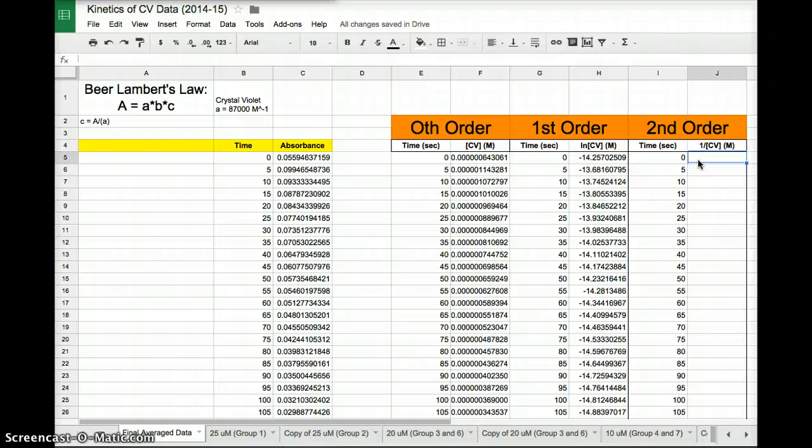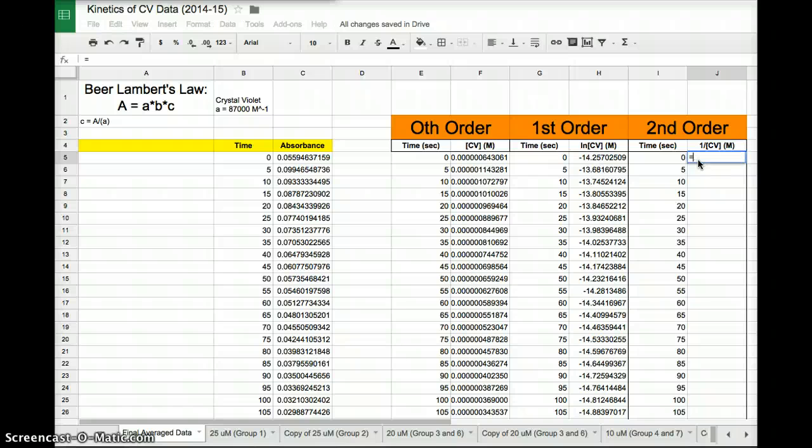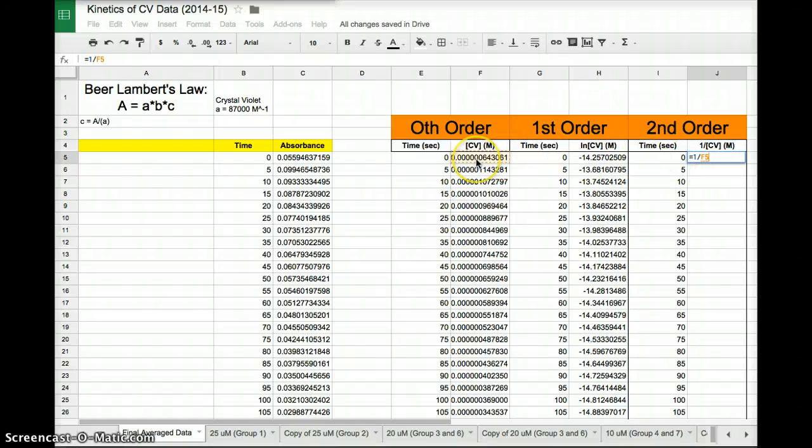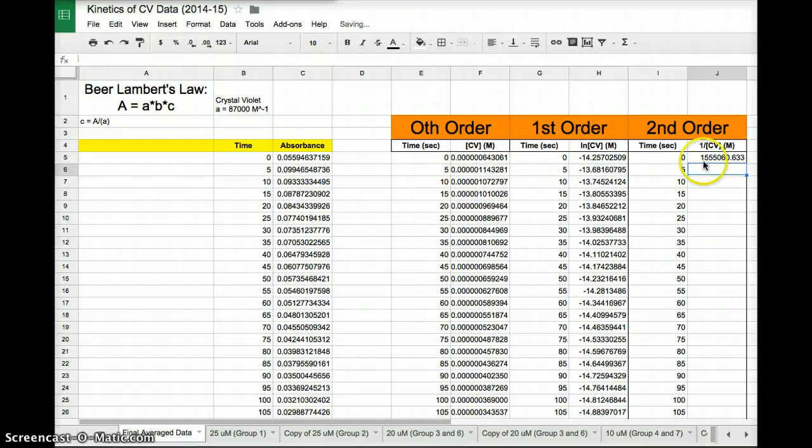Last but not least, one over crystal violet. So you might already be thinking, oh, I kind of get how to do this. If you're not sure, just go ahead and watch. I'm going to type in equals. And now I want to do 1 divided by concentration. So I'm just going to type 1 divided by concentration. Not natural log of concentration, concentration. Boom. Enter.